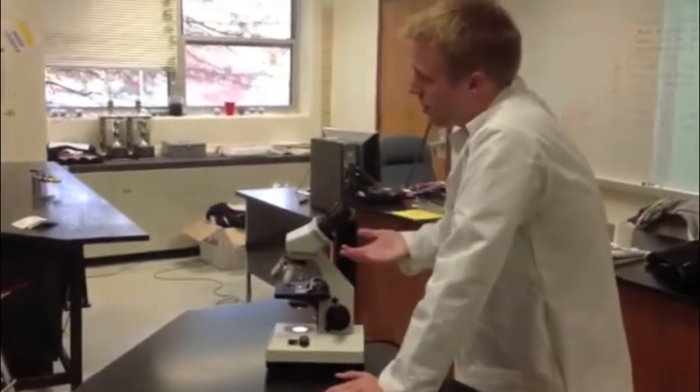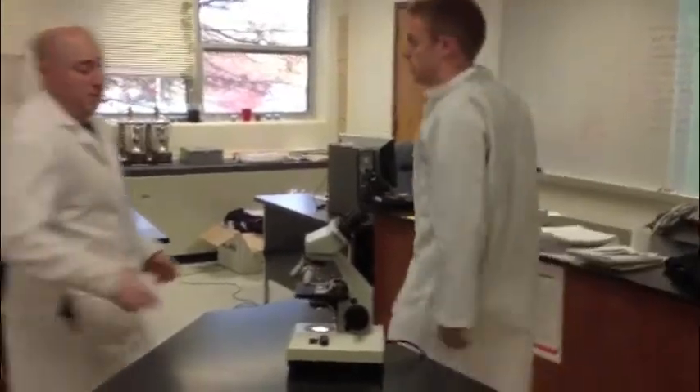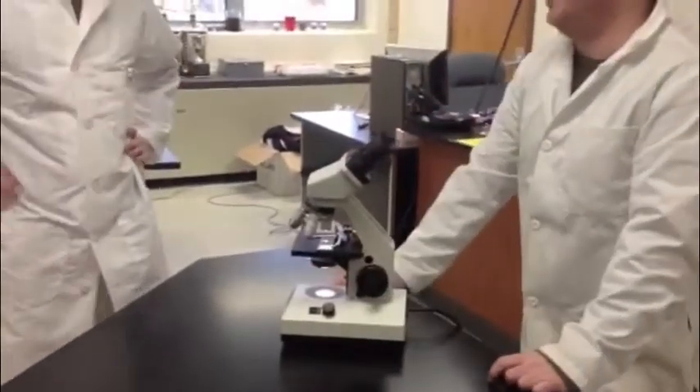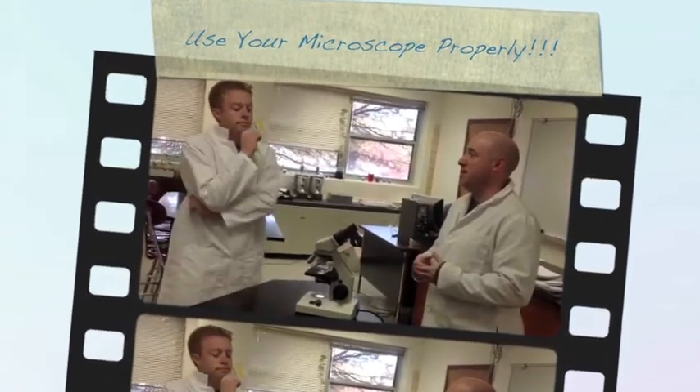I can see an object, but it just looks like a big, dark mass. There's nothing really specific. I can't see anything that looks like a cell. Let me take a look. This is a typical one. Sometimes we cut specimens too thick, and light can't pass through them. So when you want to cut a specimen, you want to make sure it's really, really thin. You take a very thin slice. That way, light can pass through and we can see all the details of the cell.